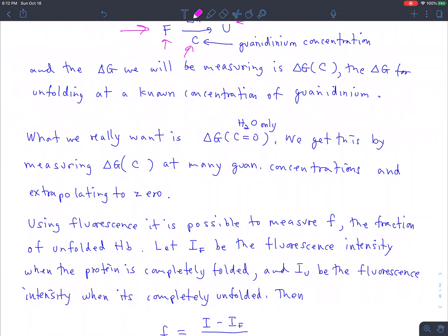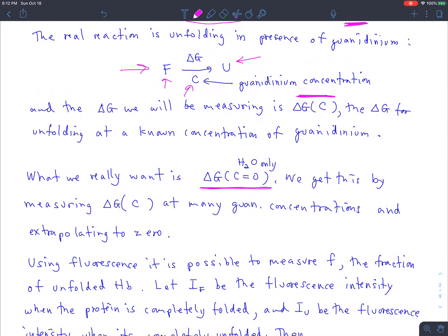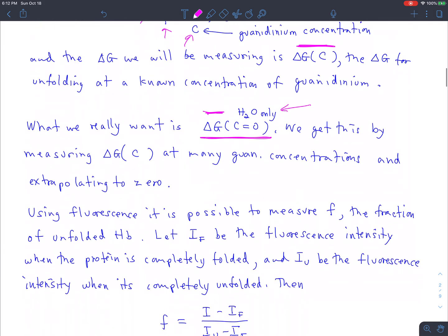The quantity that's really interesting, that's of biological and physical significance, isn't the delta G, though, at any one concentration of guanidinium. After all, that concentration is kind of an artificial thing. We're sticking that in order to melt the stuff. What we want is the delta G at pure solvent or pure phosphate buffer. I say water here, but it's really phosphate buffer.